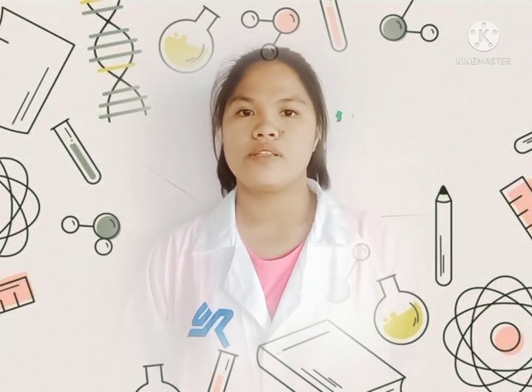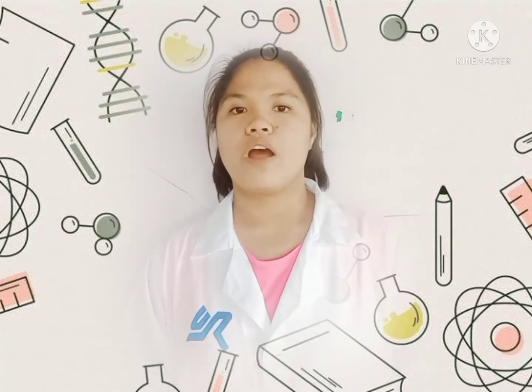Comb and wattles serve to cool their blood. The earlobes of a chicken serve hearing and other ear functions. The eyeball of a chicken is stationary, thus a chicken must move its head to vary the range of vision. The feathers provide insulation and buffer extremes of heat and cold. The wings, chicken cannot fly very well. They can flap their wings sufficiently to raise themselves above 3 meters off the ground.